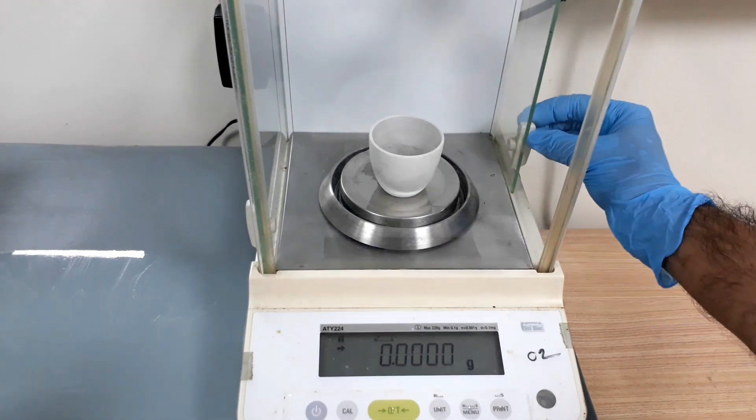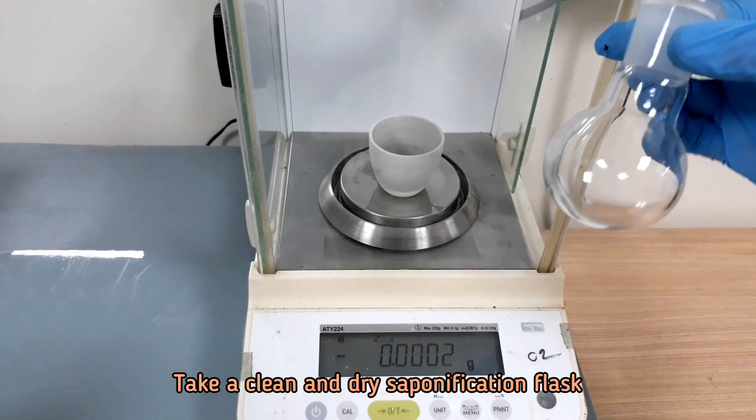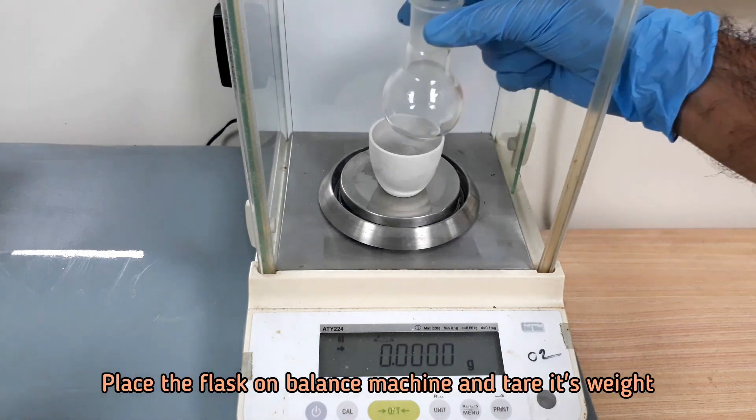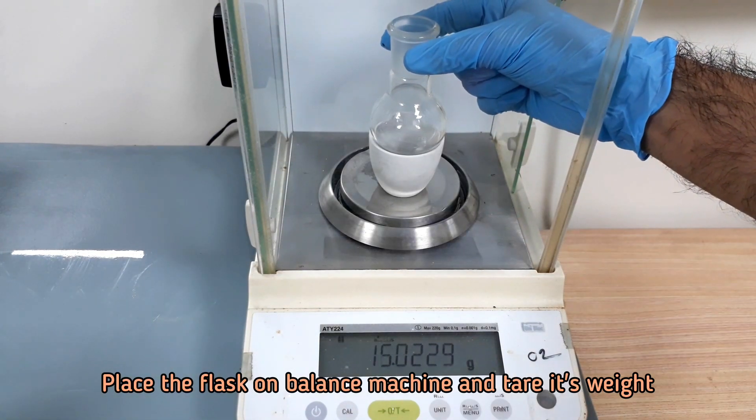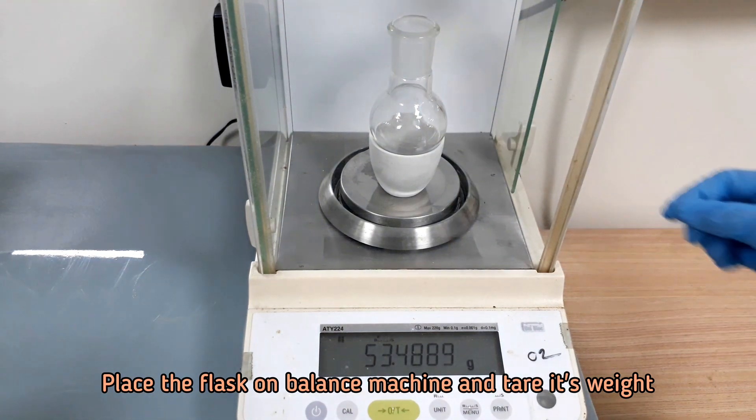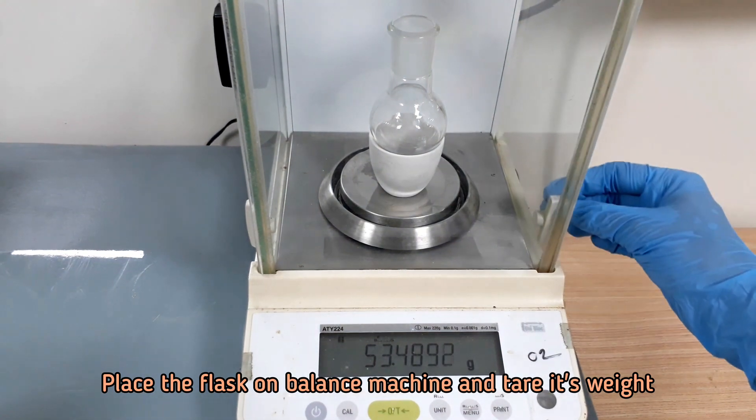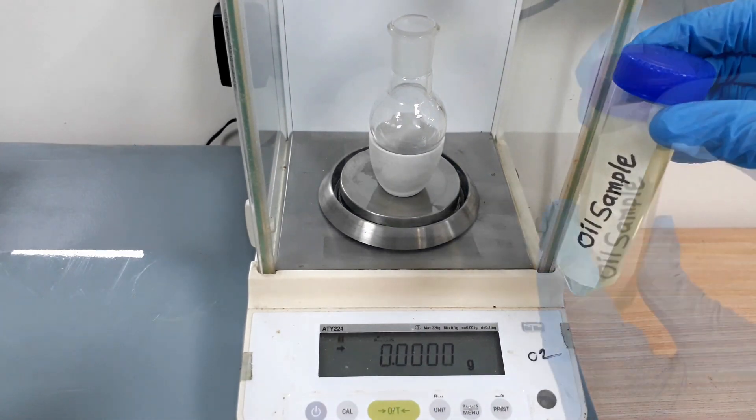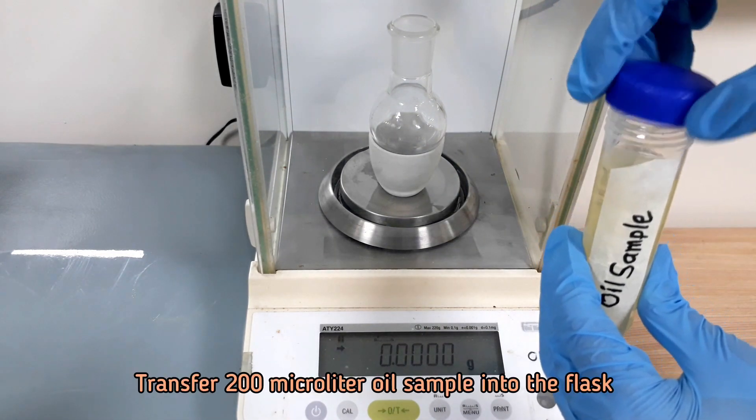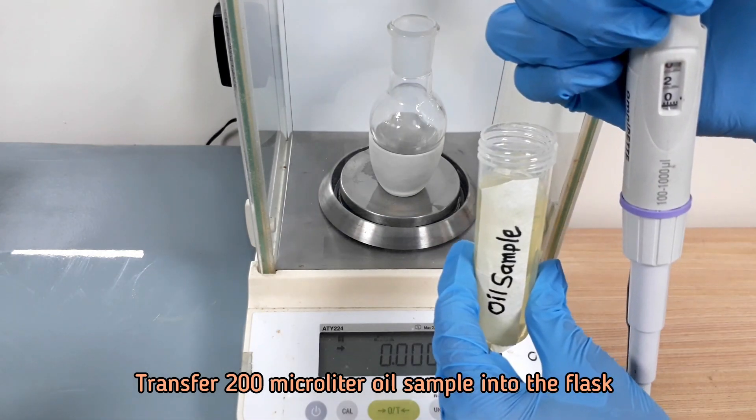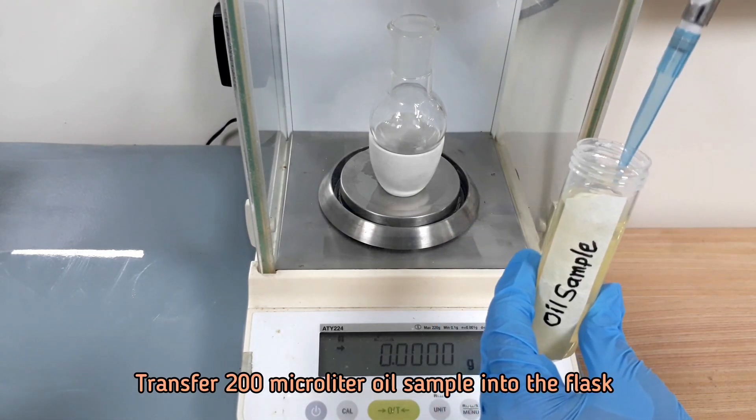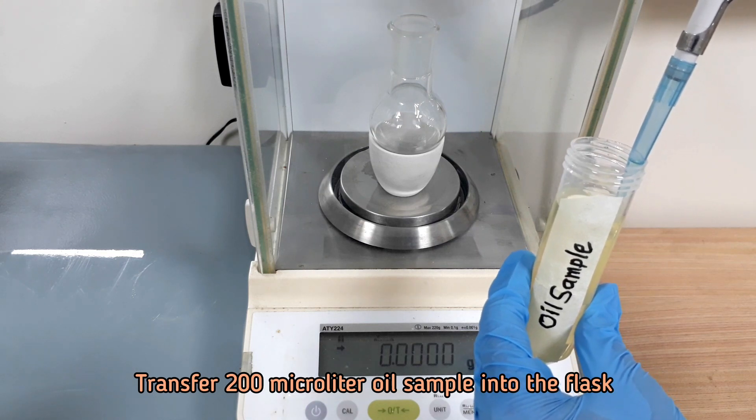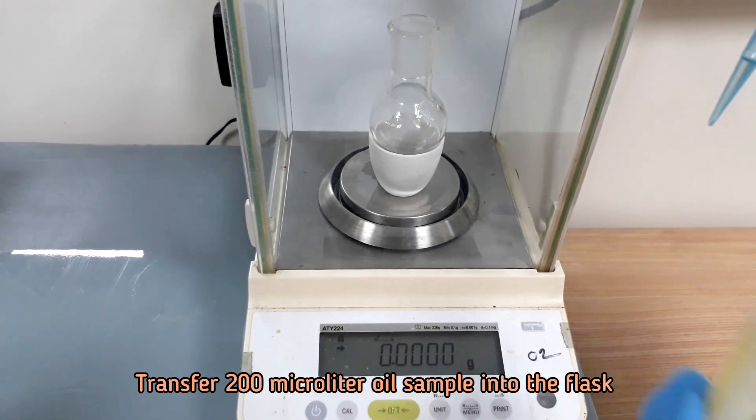Choose a clean and dry round bottom saponification flask for the sample preparation. Transfer 200 microliter oil sample into the flask and note the sample weight.